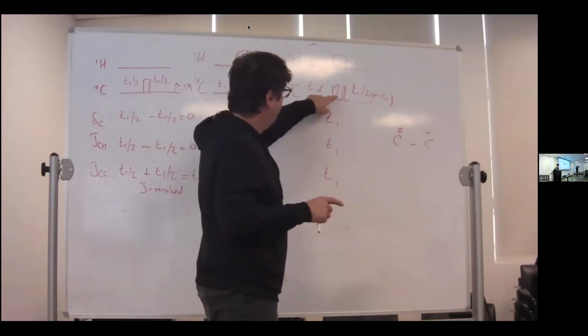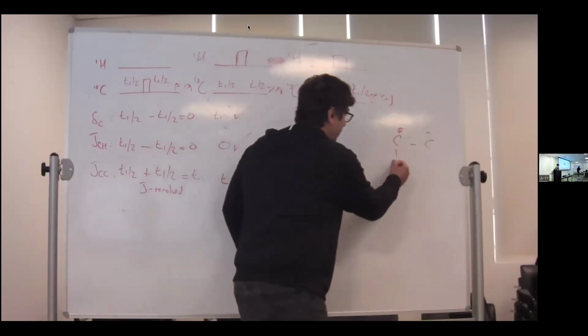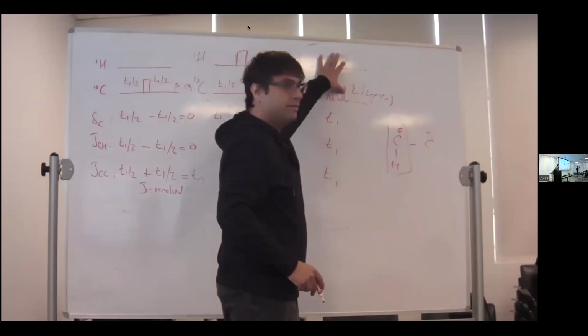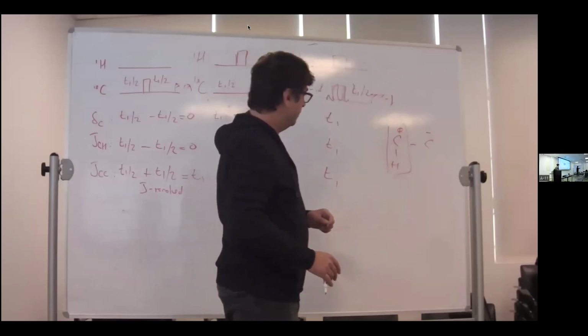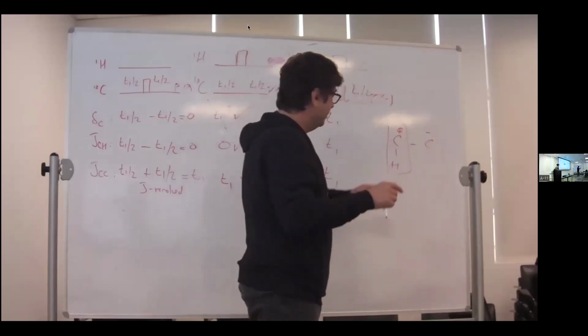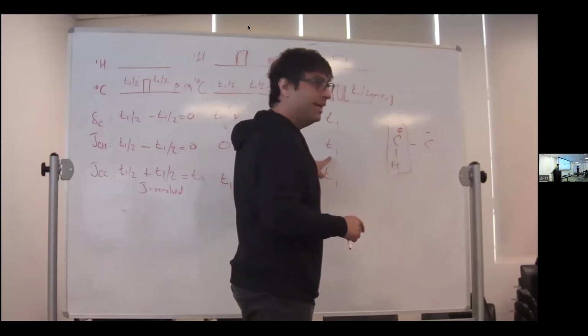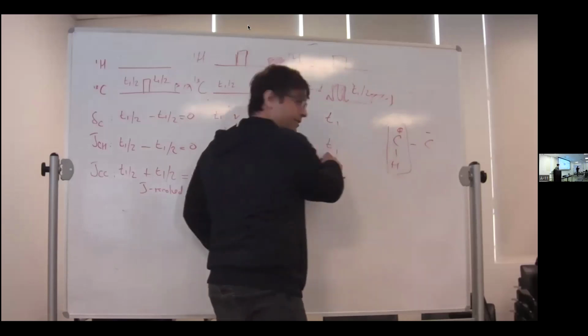No, still, I'm hitting the carbon and the proton. I'm hitting these two with simultaneous 180. No, but the selective pulse is on the... Oh, I'm hitting the other guy. Sorry, you're right, I'm hitting the other guy. So now I have decoupled the CH. So this is zero.